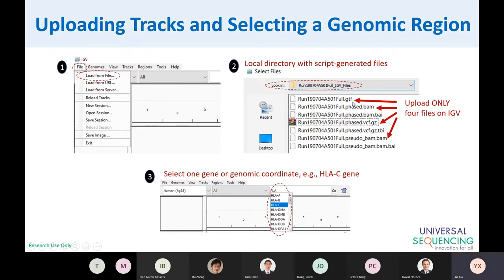The reads in haplotype 1, whether they belong to the same haplotype, maybe not, just because there's a break. So the read here belongs to haplotype 1. It's only valid in this phase block. Same thing in this phase block. So if your read is assigned to haplotype 1, this is only valid in this phase block.